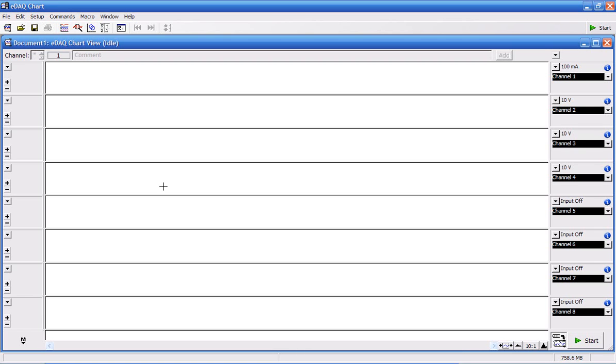You can use the EDAC potentiostat for chronoamperometry experiments. This is where you apply a constant voltage and monitor the current with time. The chart software is normally used for this.